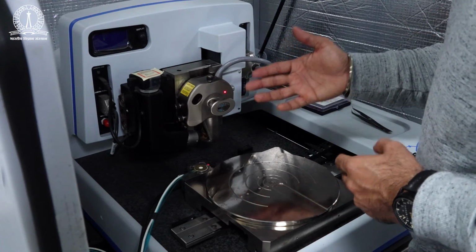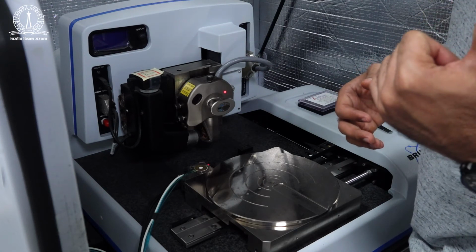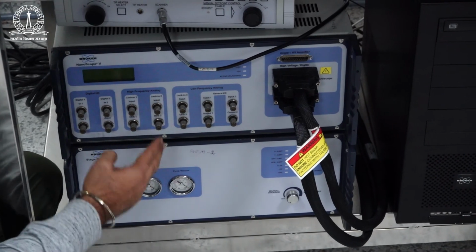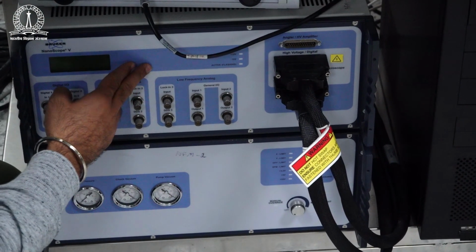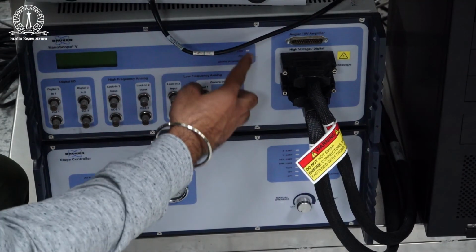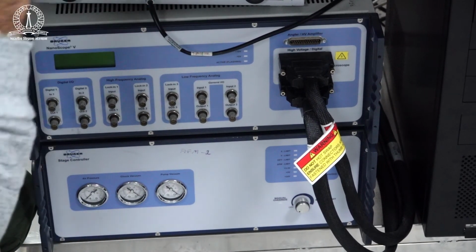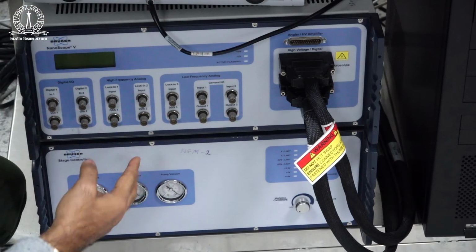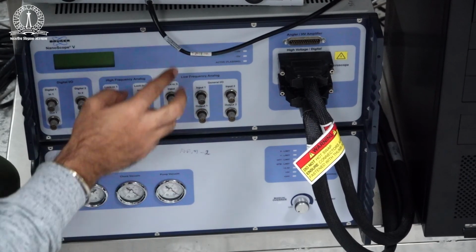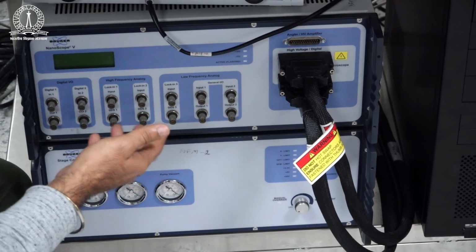After this, we are ready to do further scans by switching on the software, and for that we will look at the screen. These are the 2 controllers we have. This is called the NS5 controller, and this is called the stage controller. And right now, as you can see, there are no LEDs on over here. That tells us that the controller is off. So before we switch on the software, which can control the AFM here, we need to make sure that these controllers are on. So the power switch is right behind it. It's a very simple power switch, what you find in any machine. So we have to switch it on.